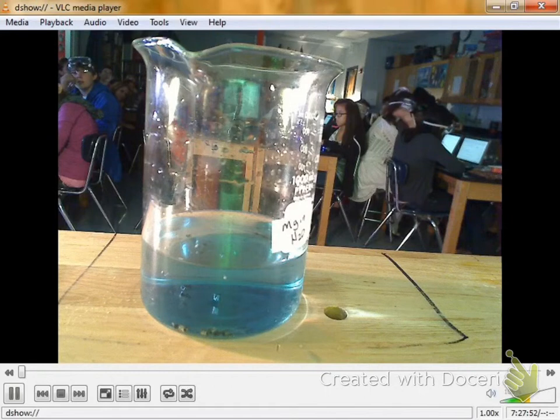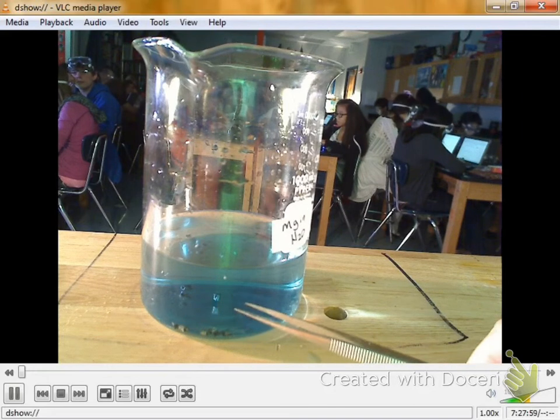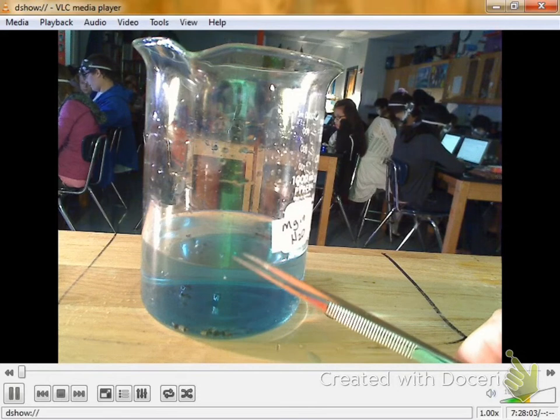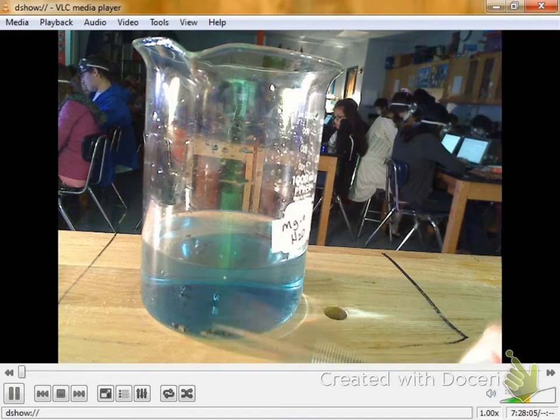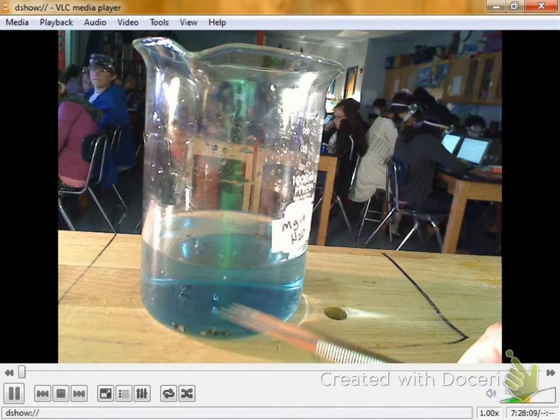Yes. What did it do? Is that still good? Oh, it didn't do nothing. What did it do? It sank. Yeah, it sank. See it down here on the bottom? See any bubbles forming around it? See any bubbles on the top of the water? Color change? Not really. No, not really.